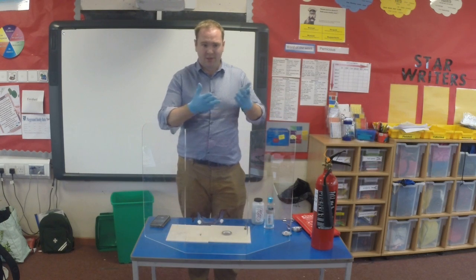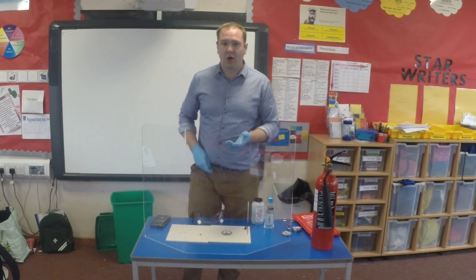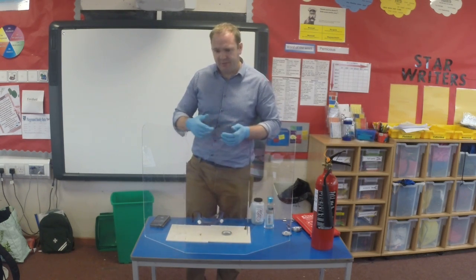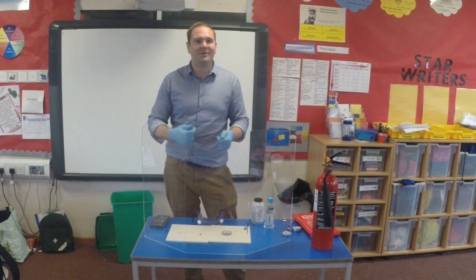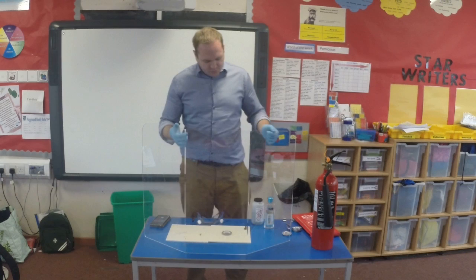And in terms of an actual lesson, you can get the kids to note down anything they see that indicates a chemical reaction is taking place. And it's far more engaging and, let's say, aesthetically pleasing than the standard vinegar and bicarbonate soda stuff that we often do at primary school to death.